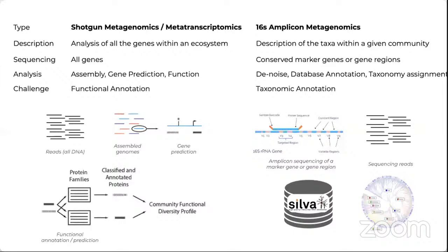This 16S sequencing is a technique that is widely used to study the microbiome directly in its environment, and this will focus on either, as I already mentioned, 16S or 18S ribosomal RNA that has to be amplified using the PCR amplification method before getting quantified and matched onto the database of known 16S rRNA sequences. So these sequences contain hypervariable regions and variable regions that provide species-specific signature sequences that are extremely useful and are used to identify bacteria and their taxonomic ranks.